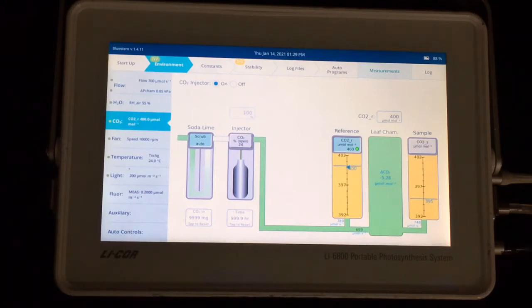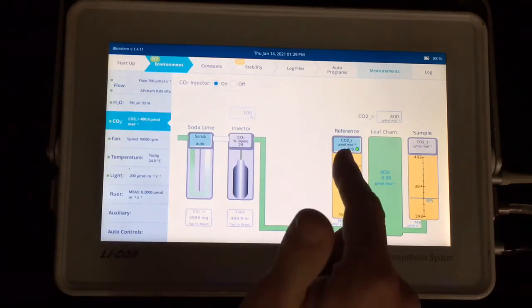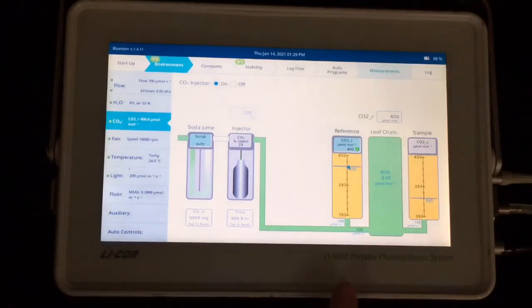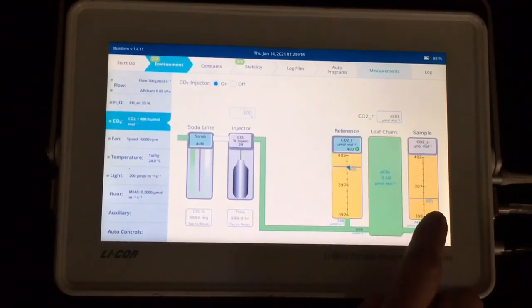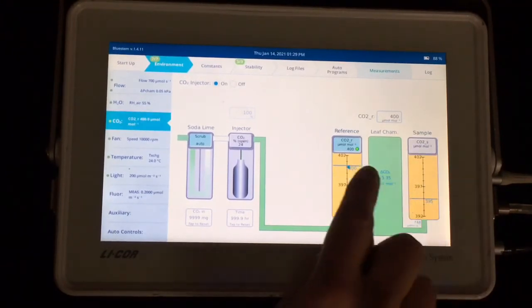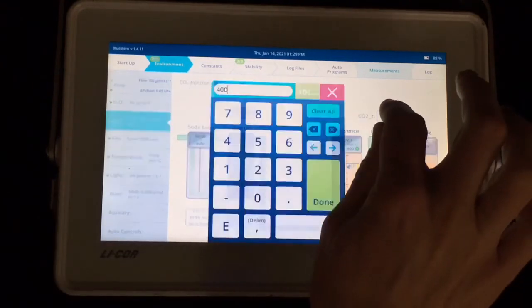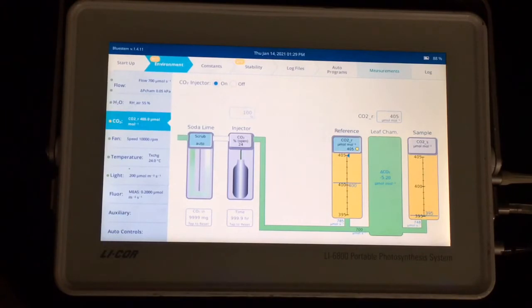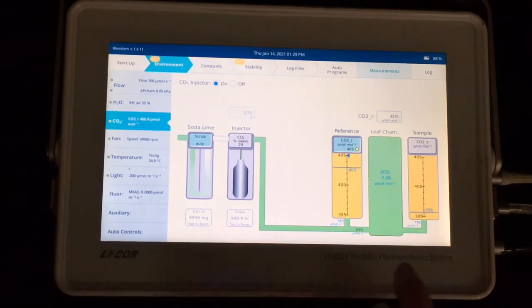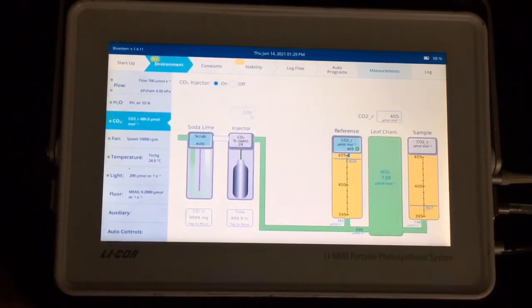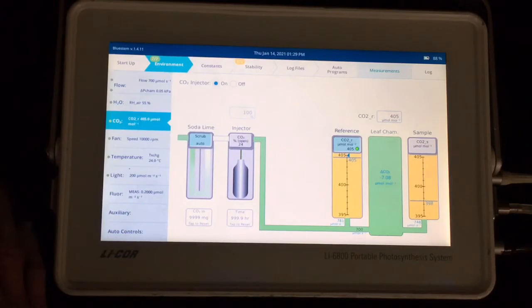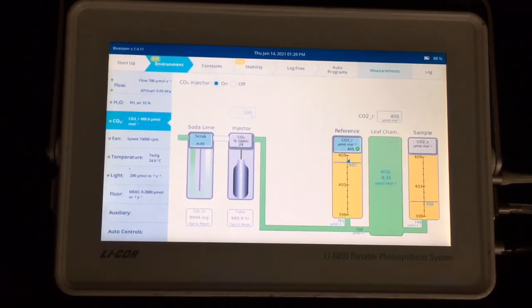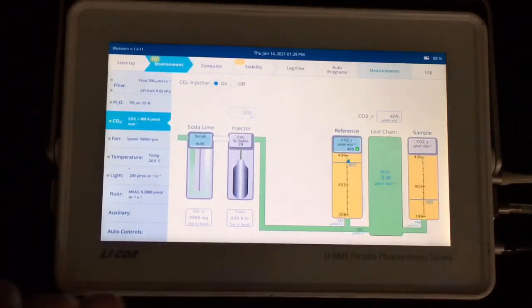And so this is, again, a choice to make. Another common choice that can give you both faster measurements is to clamp on a representative leaf like I've done here. And note that my delta CO2 is about 5 ppm in my case. And so I can control on reference at 5 ppm above that ambient concentration, so about the delta I'm expecting. And now my CO2 sample will be right around 400, which is what that leaf was experiencing prior to me clamping on it. So those are the choices for this control loop.